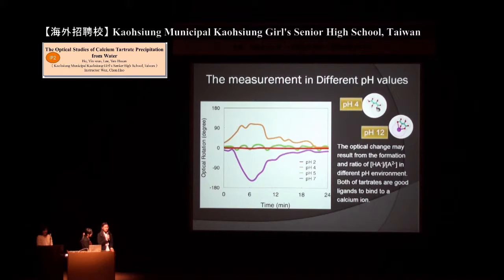You should try to stop the reaction and filtrate. We never tried it because we can't stop the experiment. It keeps moving. It's hard to choose a time to stop it and get a precipitate.